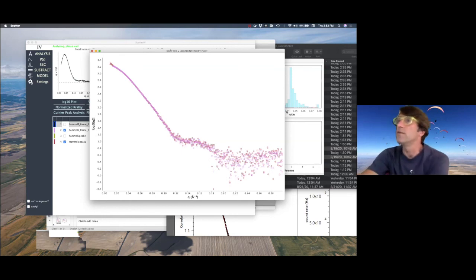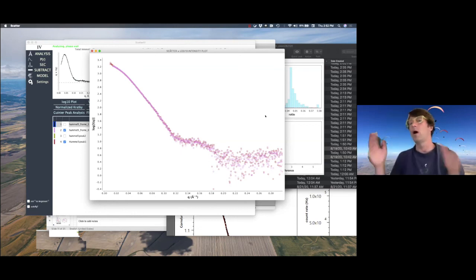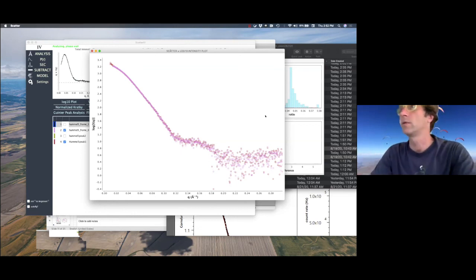What does it mean if the molecular weights are too different from each other according to different calculations? That's a good question. I showed PRIMUS, and they have been using the MOW, the Porod volume, and volume of correlation calculations. If they are different, you still need to accept about 10% error for the molecular weight calculation from the SAXS. It's getting more difficult if you have unfolded regions, and if you have unfolded proteins, it's almost impossible to define an accurate molecular weight.